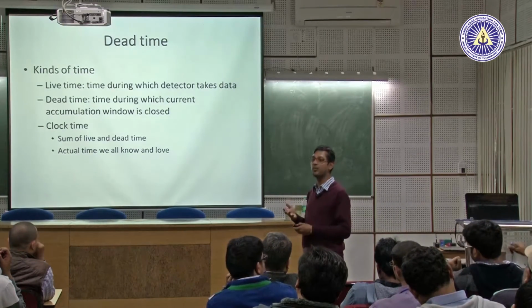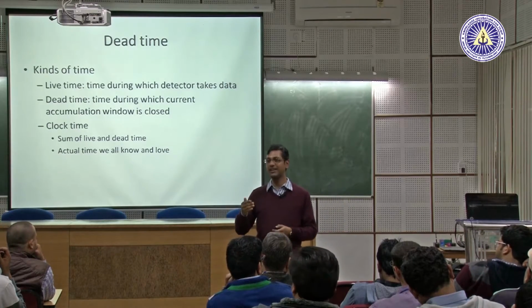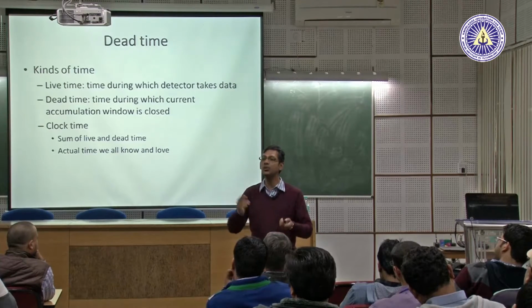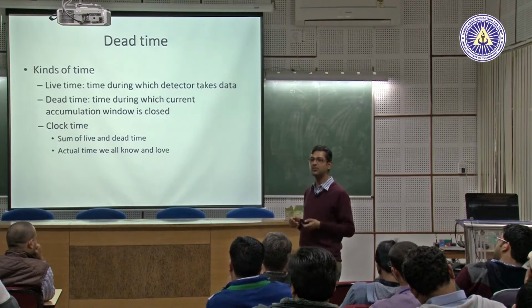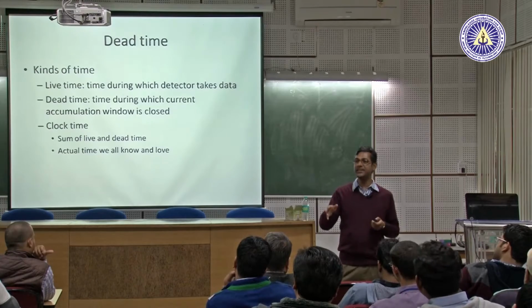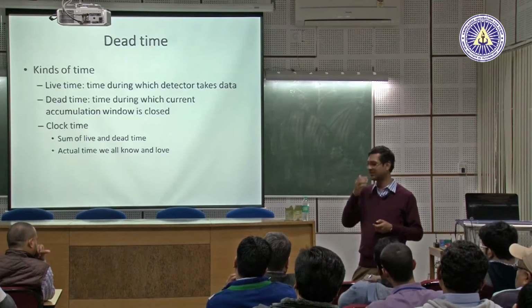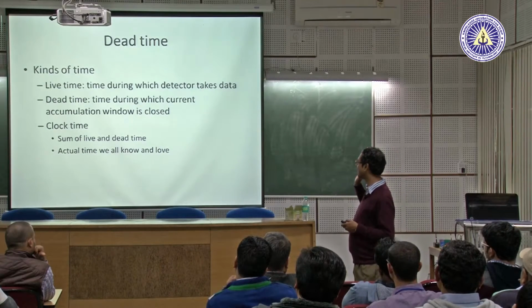But it creates a problem, because you have a liquid nitrogen layer, the Dewar flask, and the X-rays have to penetrate that distance. Then you lose information. So nowadays we have liquid nitrogen free detectors, where it is no longer Si(Li) technology, it's a different technology. So there you don't need that.